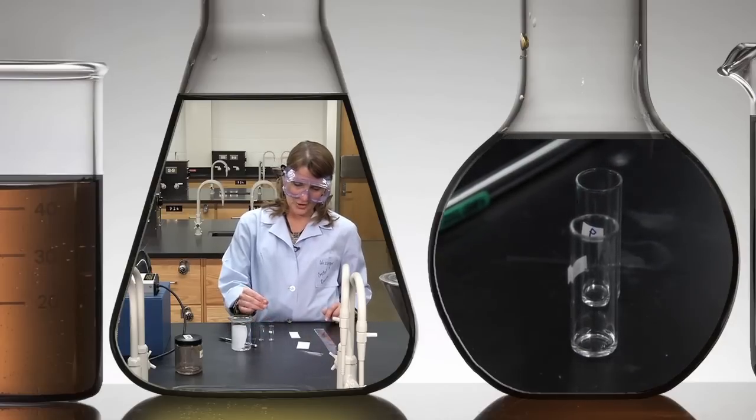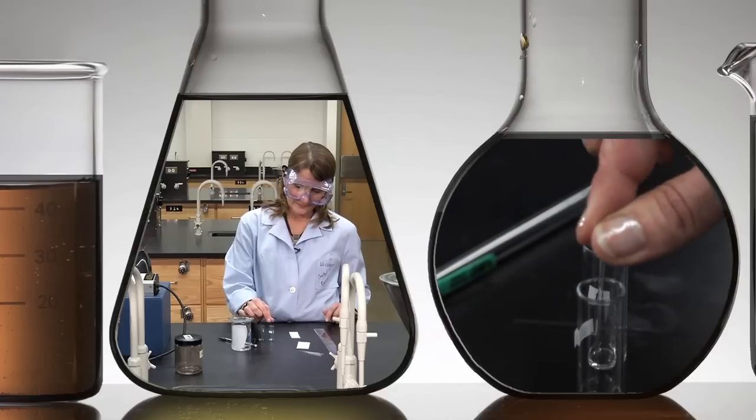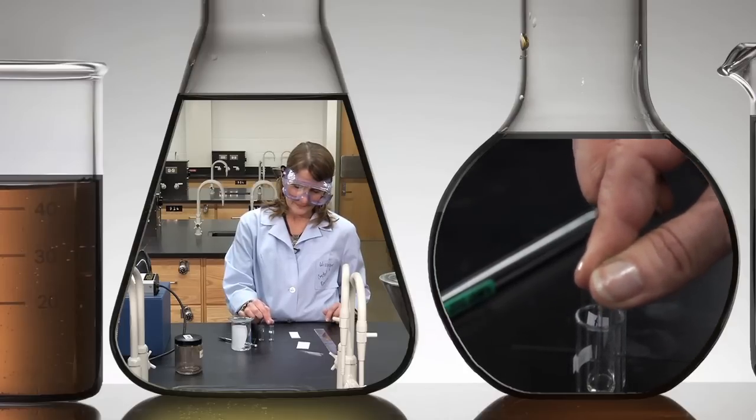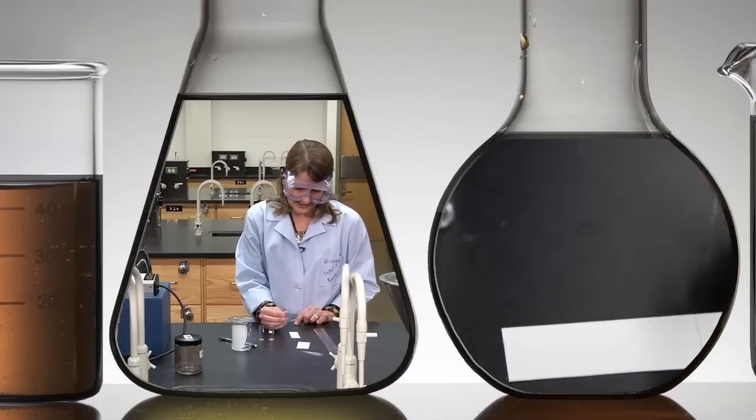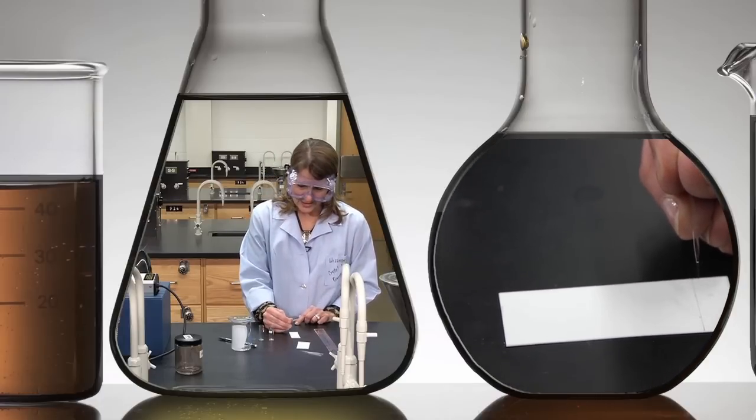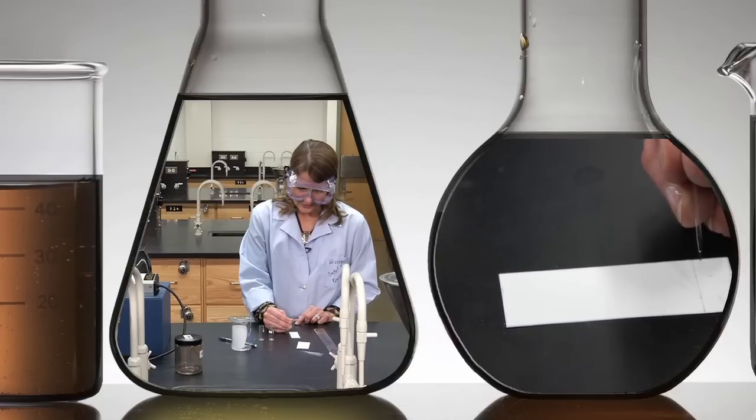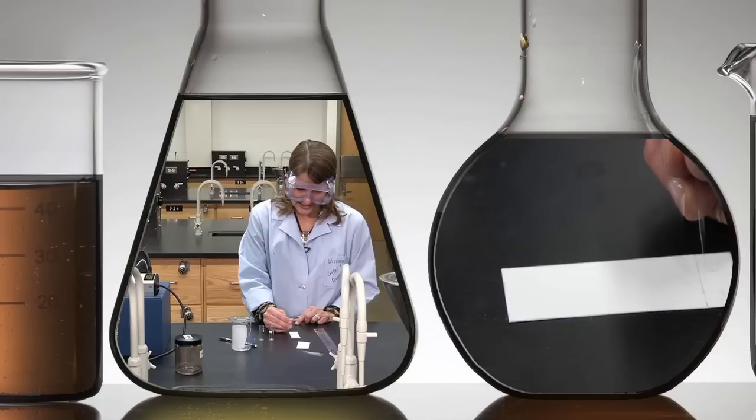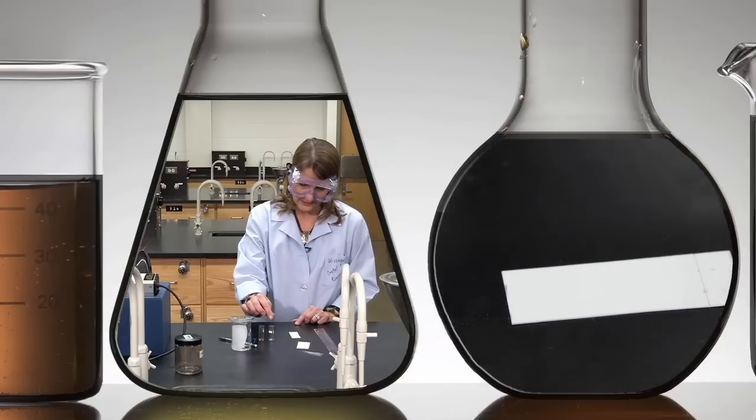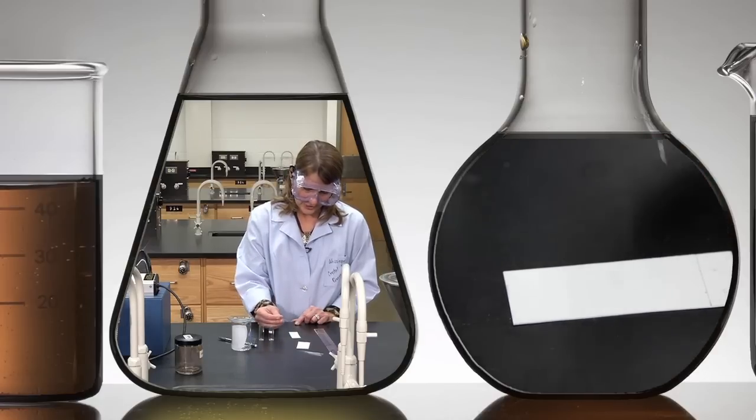Now we want to spot it on the plate. You draw up a small amount of the sample, place it on the dot that you've made, and you can see that the solvent spreads out. You just want to dab lightly to add the spot.